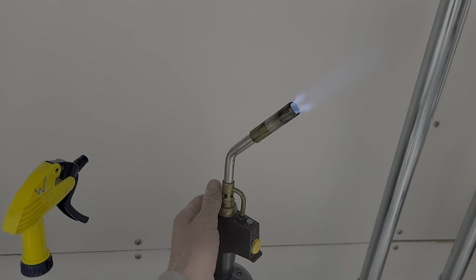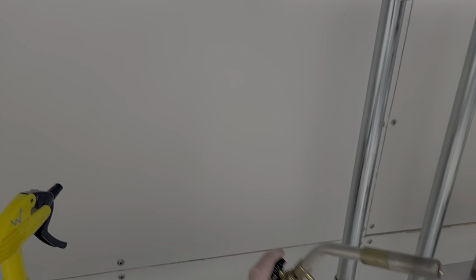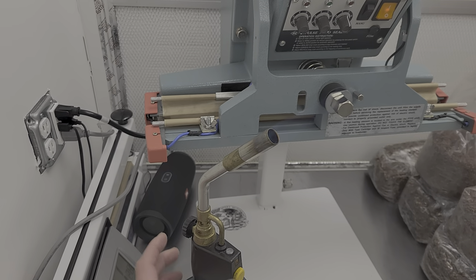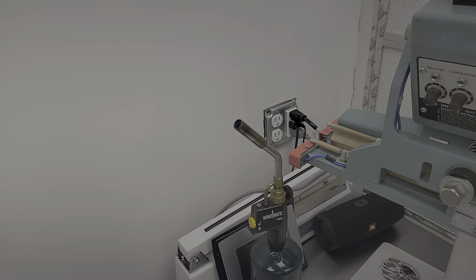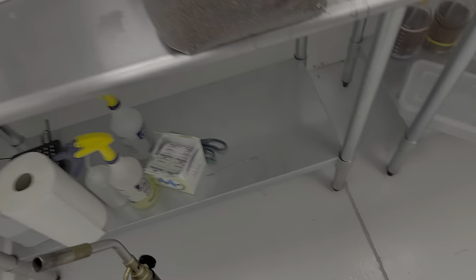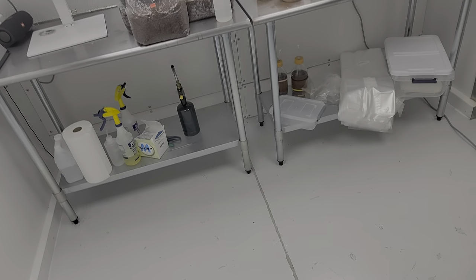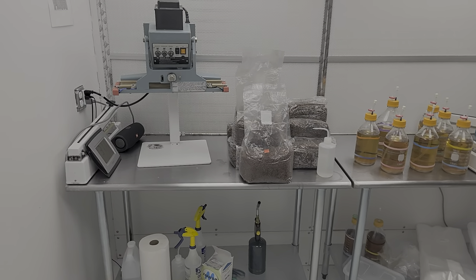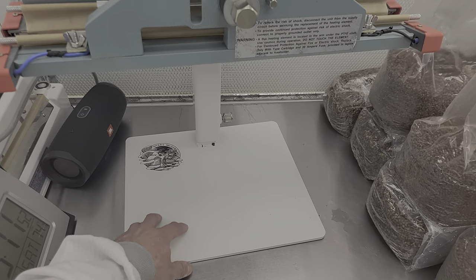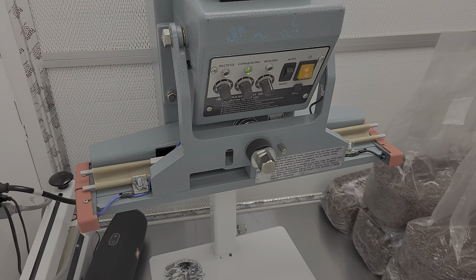My torch is down there out of the way. This is my favorite torch — it's the one with an adjustable flame knob, not all of them have that. If I'm doing a bunch of work I'll put it on the table, adjust it down to barely on, and put it to the side so it doesn't burn me — that's how I do all my tip sterilization. For a quick torch I just blast it underneath the table. I also have my sealer stand — an adjustable sealer stand for the AIE double jaw sealer that we sell on myersmushrooms.com.